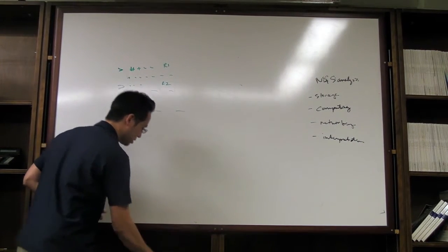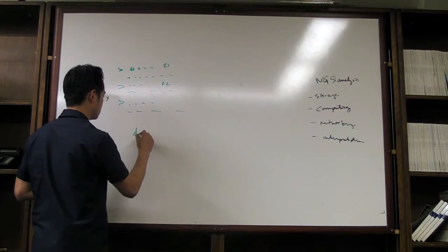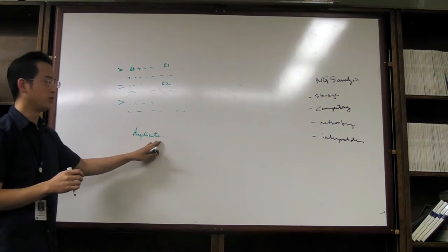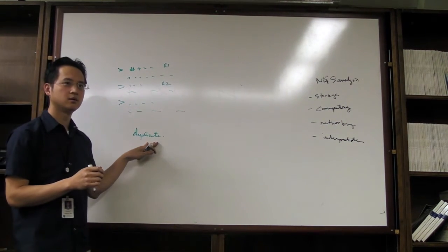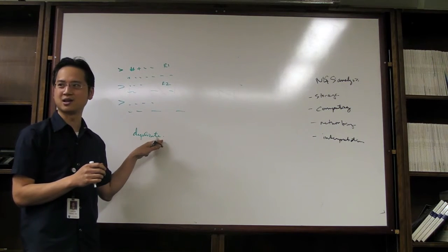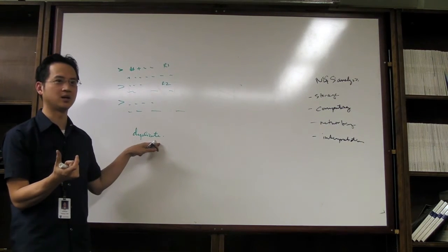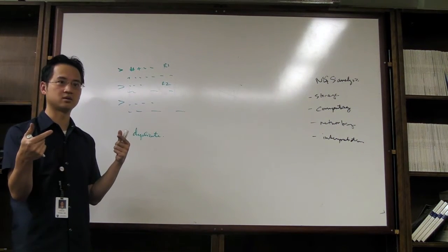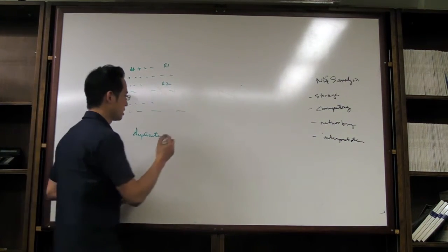The next thing you want to do is a duplicate analysis. This should be pretty standard, but it really depends on your application. If you're doing a PCR-based assay, it doesn't make sense to do a duplicate test because everything you do will be duplicated. Everything starts on the same start site and ends on the same stop site. So a duplicate check is to do this.